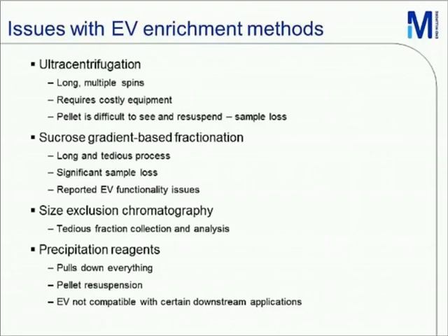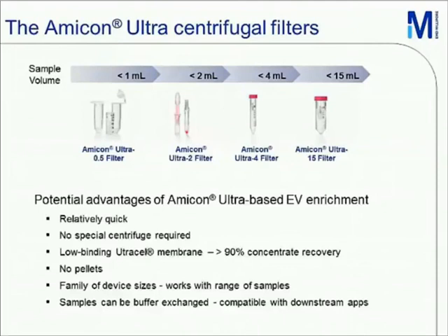Size exclusion requires fraction collection and analysis. And the precipitation methods suffer from pellet resuspension issues, as well as incompatibility with certain downstream applications. One potential alternative for EV enrichment could be membrane-based filtration.